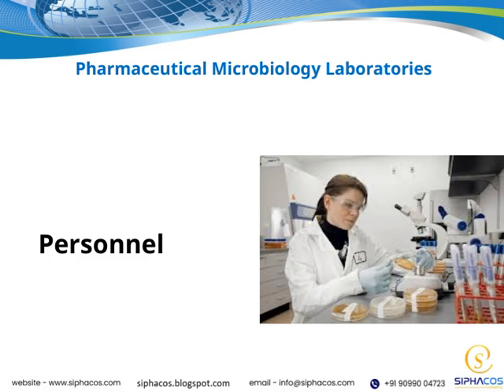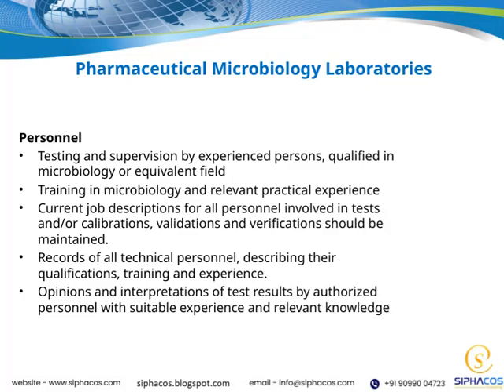Connecting this to the overall theme, the competence and diligence of the laboratory personnel are fundamental to maintaining the integrity of pharmaceutical products. Their role is vital in safeguarding public health by ensuring that only safe, contaminant-free medicines reach the market. Now, let's take a look at the personnel in pharmaceutical microbiology laboratories.